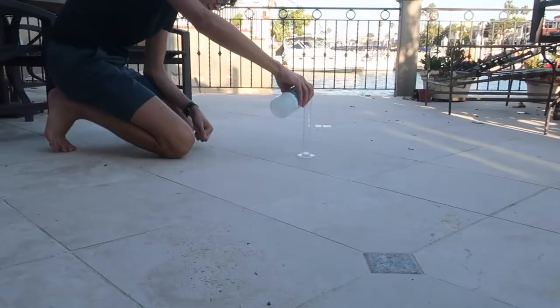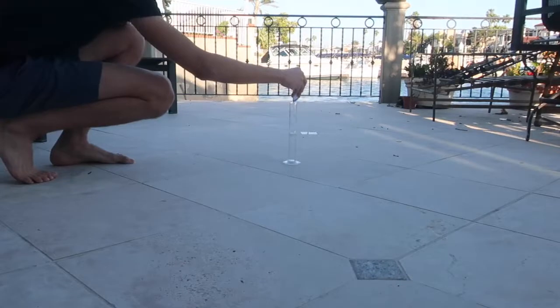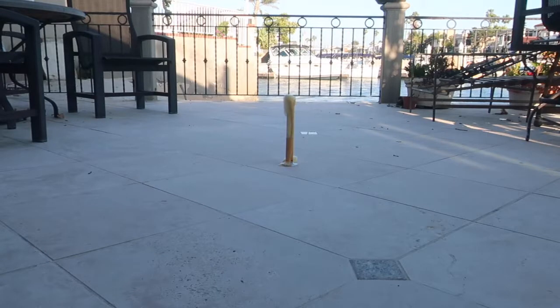For the elephant toothpaste reaction, I poured 50 milliliters of 30% hydrogen peroxide into a graduated cylinder and added some dish soap. I then added 8 grams of potassium iodide. This is actually the same reaction as the last experiment. However, instead of trapping the oxygen in a flask, all of the oxygen bubbles mix with the dish soap and create foam, making it look like elephant's toothpaste.